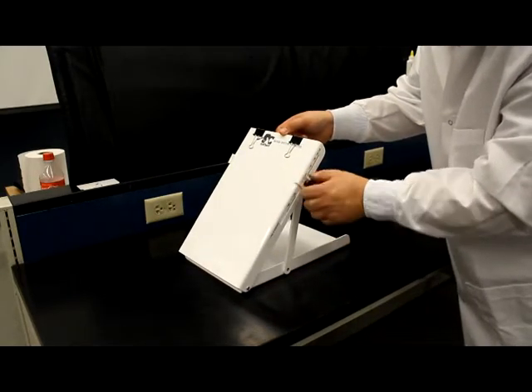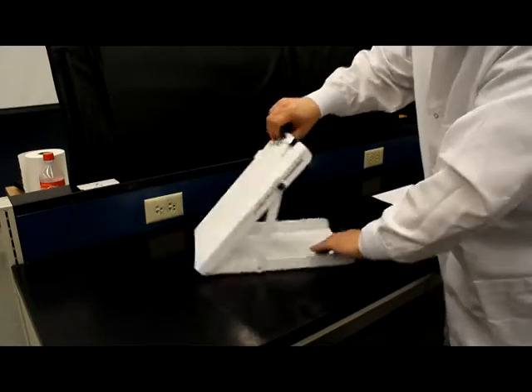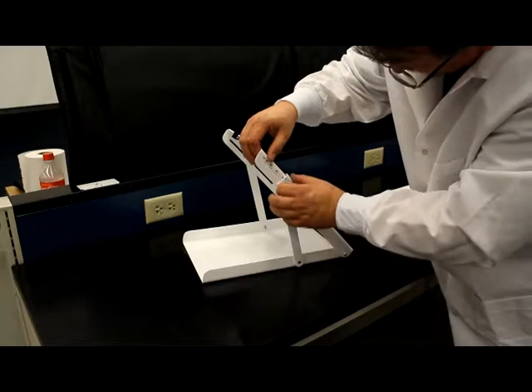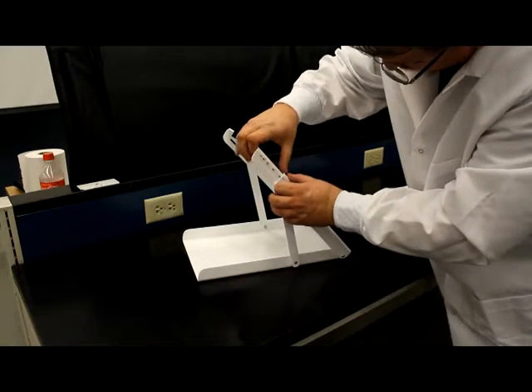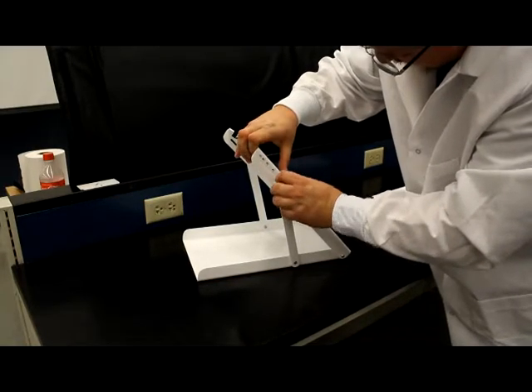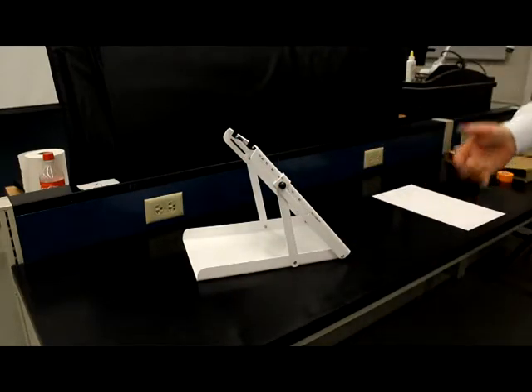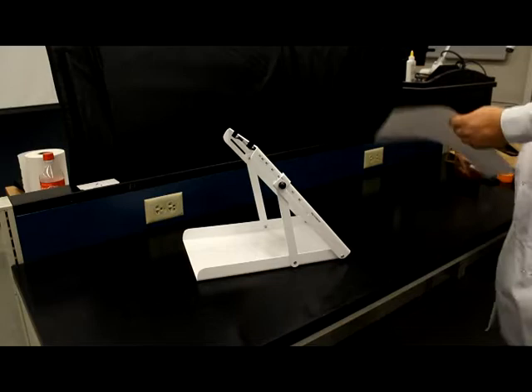Go ahead and tighten one side. Turn your apparatus around, and you'll notice that it's not quite set at 50 degrees. Go ahead and set it correctly, and then tighten it down. You now have your apparatus set up correctly so that you can drop blood.